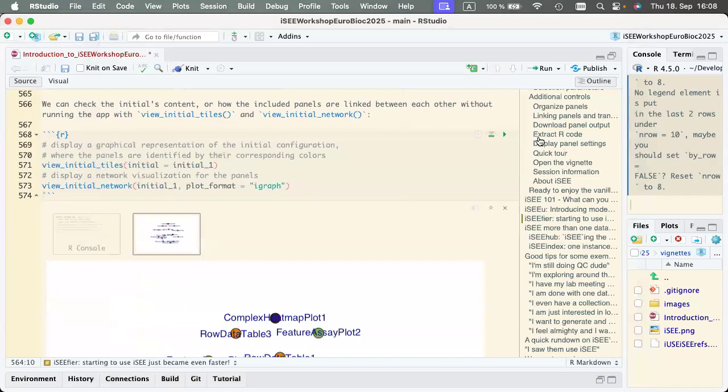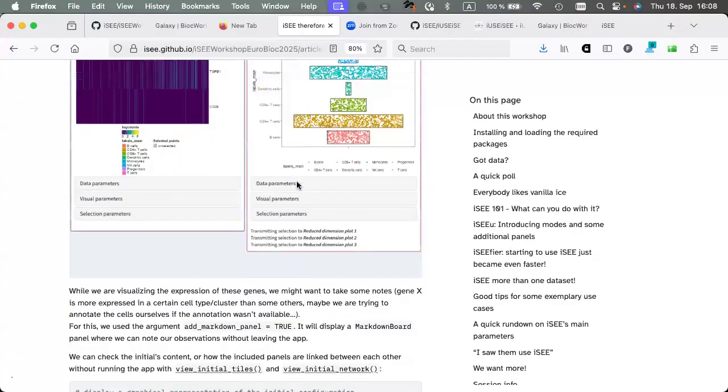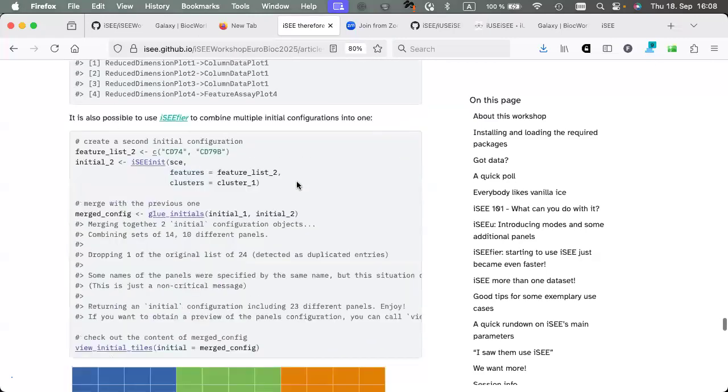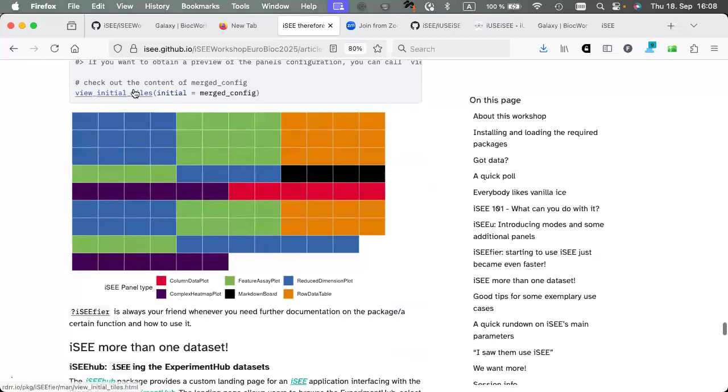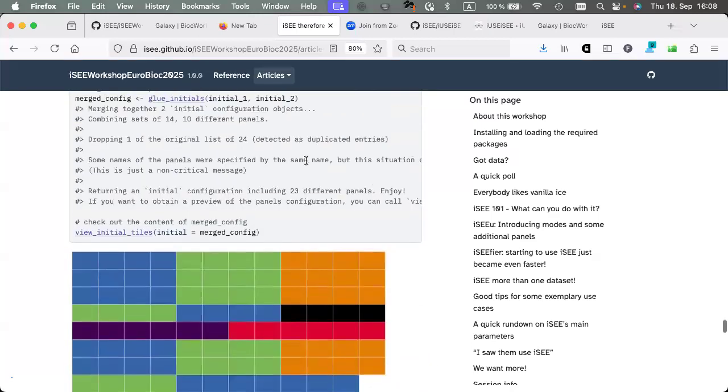So you can see that it becomes fairly easy to start up the app and initialize quite fast. It looks more or less the way that we want. We actually decided that it would be cool to be possible to stitch together a merge configuration.